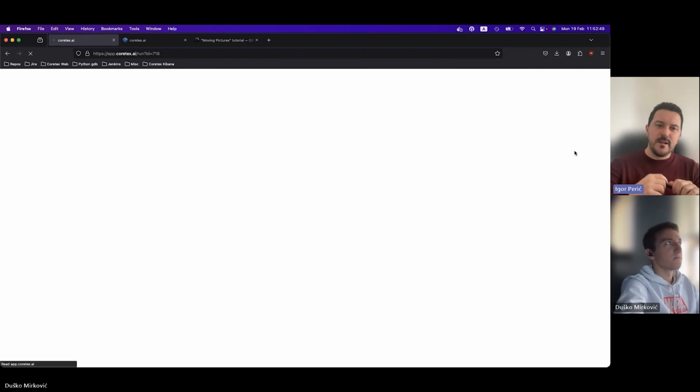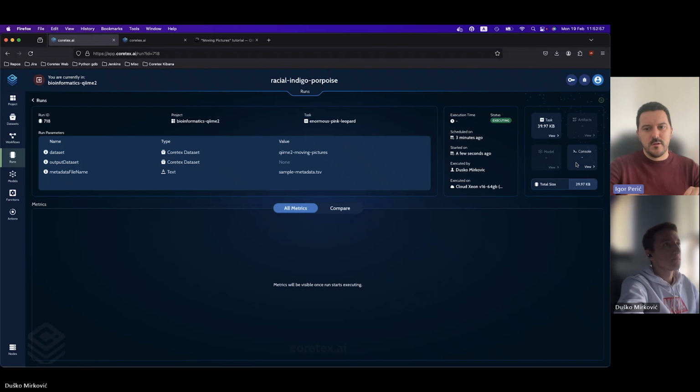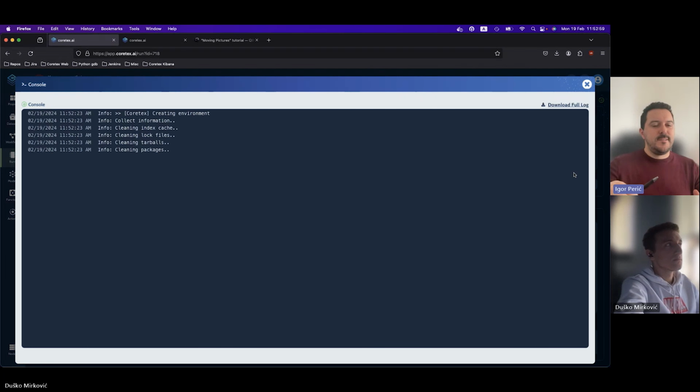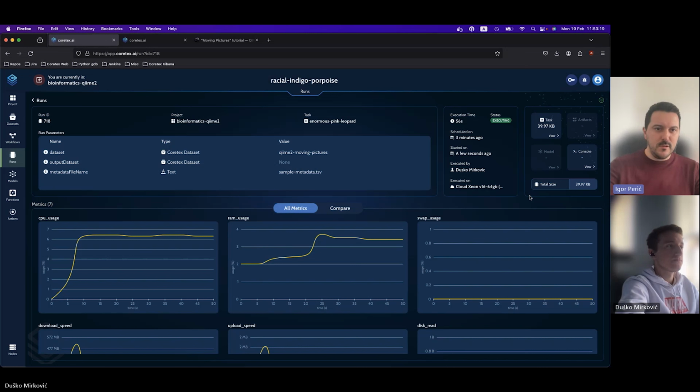That's cool. So it automatically detected that one of the machines was booted up, and it started executing the run over there. So you don't have to wait for a machine to be available, try to SSH, kick off the experiment, or think about terminal sessions that, when you close your SSH session, it doesn't go away, things like these. And also you get notifications when things are finished. And optionally, you can also get results in the email with the notification and things like that.